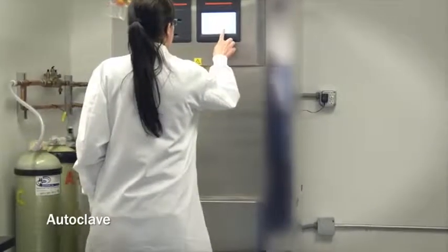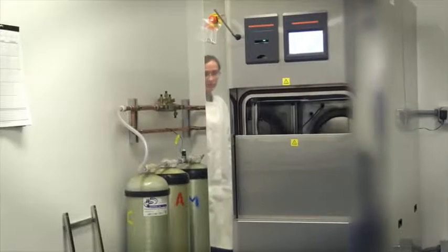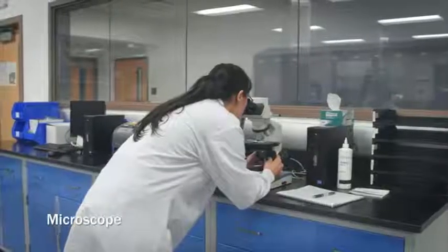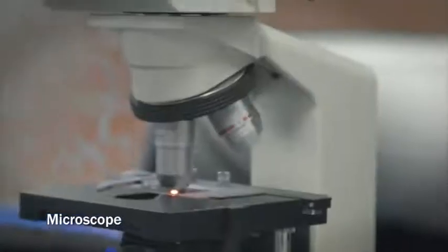The autoclave is a very important and unique instrument in every microbiology lab. What that does is it sterilizes the media used for testing microorganisms, as well as sterilizes product that has been tested. We also have a microscope in the microbiology lab which we use for identifying microorganisms that we may see or grow on some of our petri dishes.